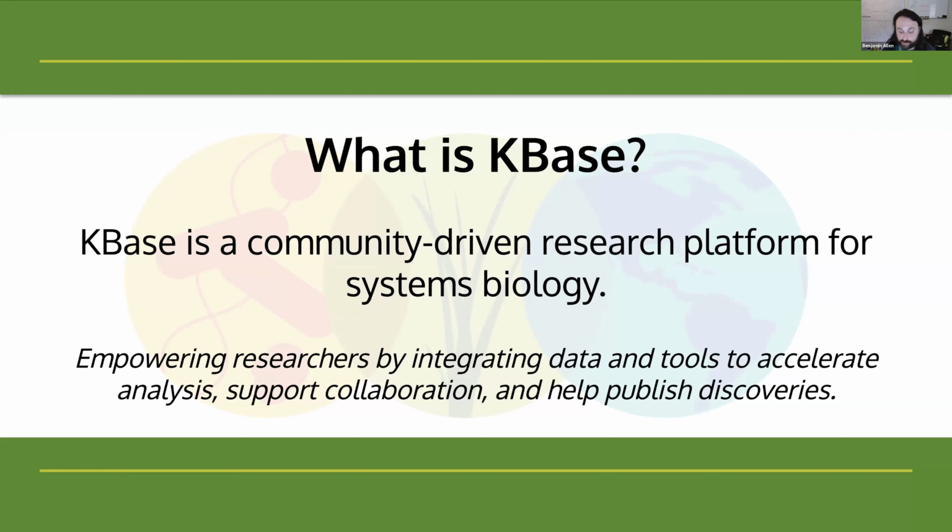So in addition to the tools, we bring in some of the relevant reference databases that are especially useful for doing comparative genomics and other comparative analyses. We also try to support researchers working together. So we have a couple of features that enable collaboration that I'll demonstrate later on in the webinar.